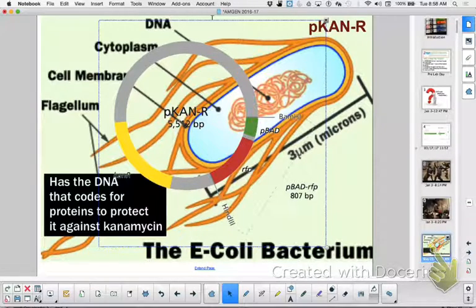So this particular one has, and this is where, go into your notes on that one. I'll go into mine so I match you, potentially. Okay, so if you look at the plasmids, I'm going to show you the ORI sequence in just a minute, which initiates DNA replication. But go to where it says pKAN.